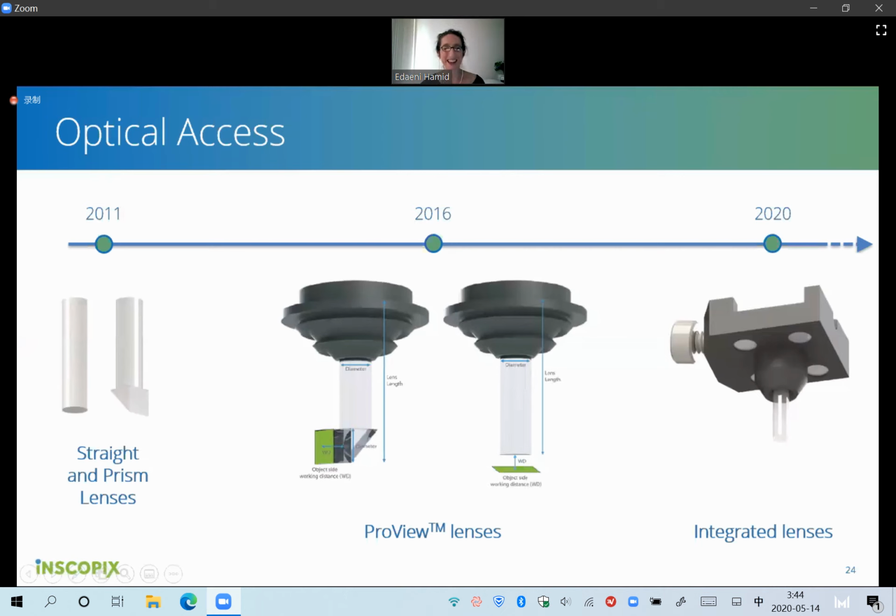I think the only other thing I can think of to mention is that if people are familiar with some of our older microscopes, the eFocus is just an easier thing to work with. Even when we're talking about longitudinal recordings, sometimes things change over time. I mean, we're talking about biology. So it's possible that you get slight shifts in tissue around the lens over time.